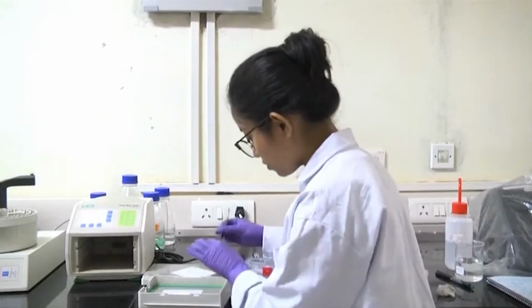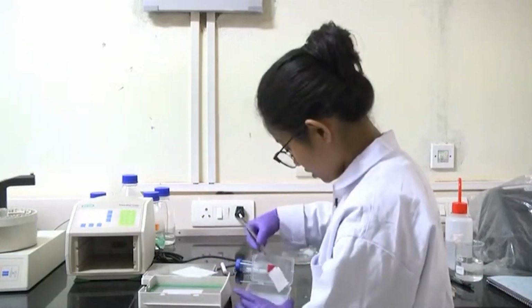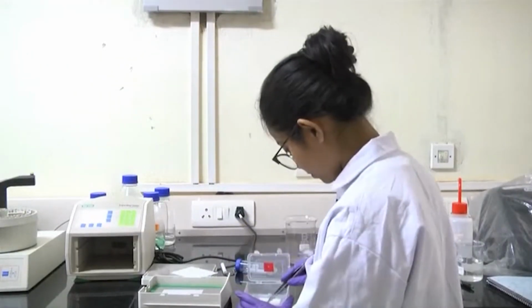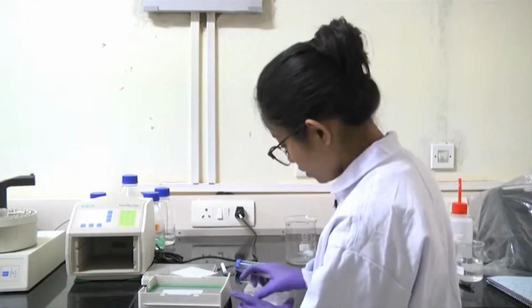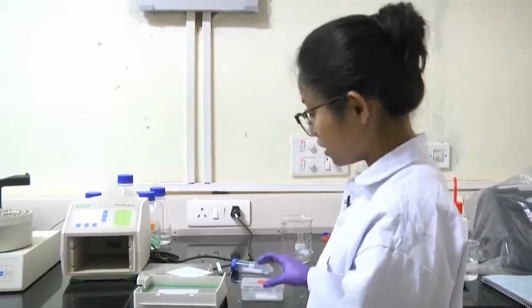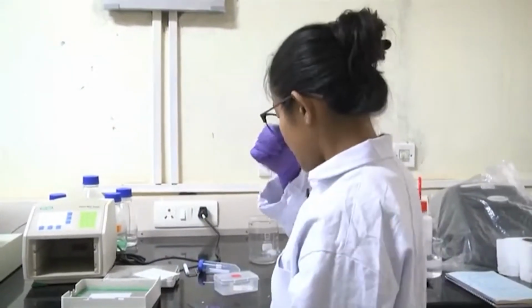And I will put the membrane that has my protein in the blocking solution. Now, I will keep this in the rocking condition for almost 2 hours. The blocking time you have to check depending on your protein and the gel. I am keeping it for 2 hours because I know after 2 hours the blocking efficiency will be good.